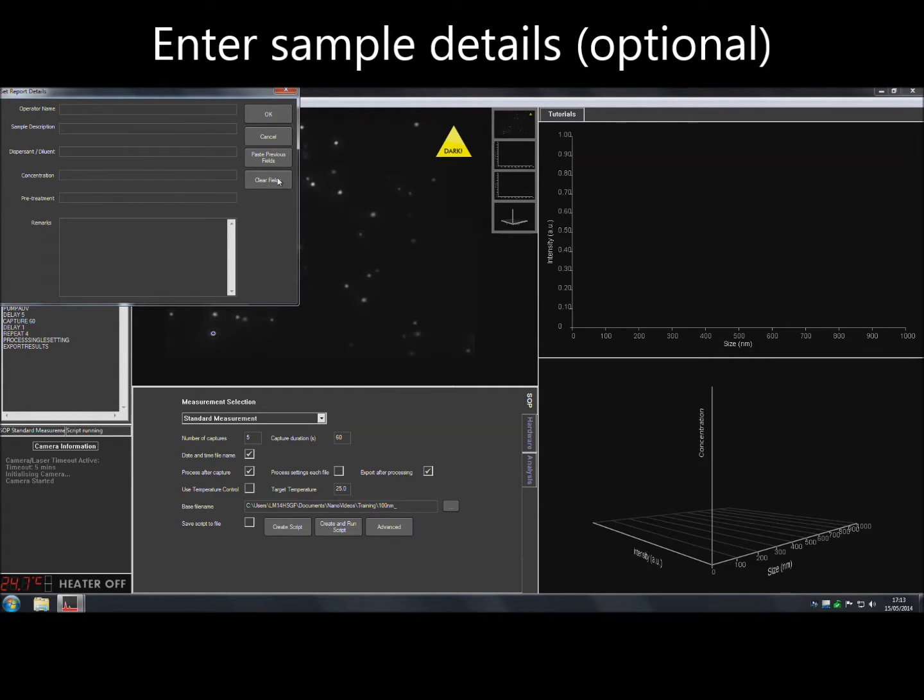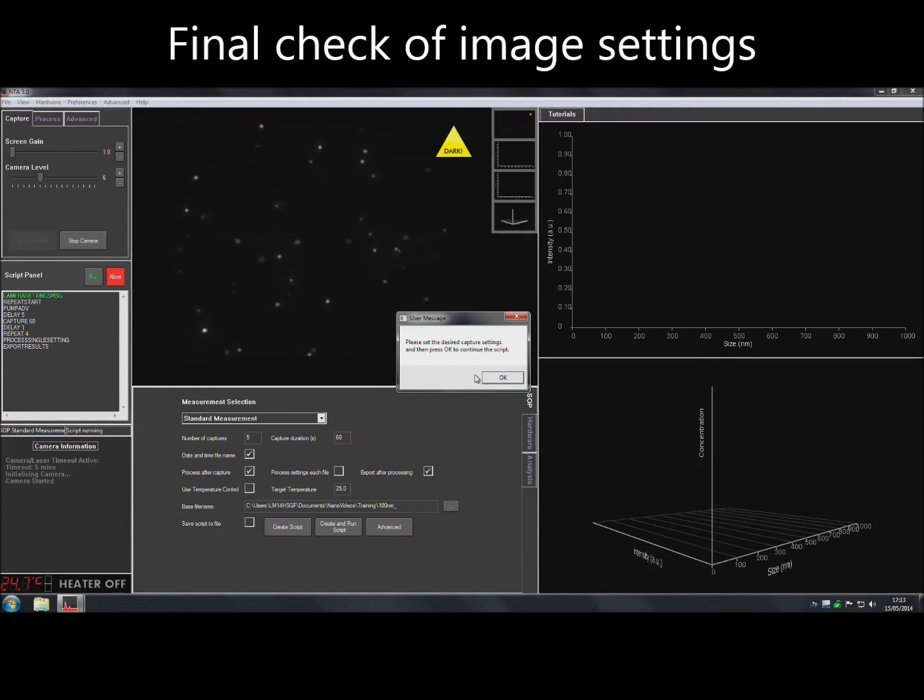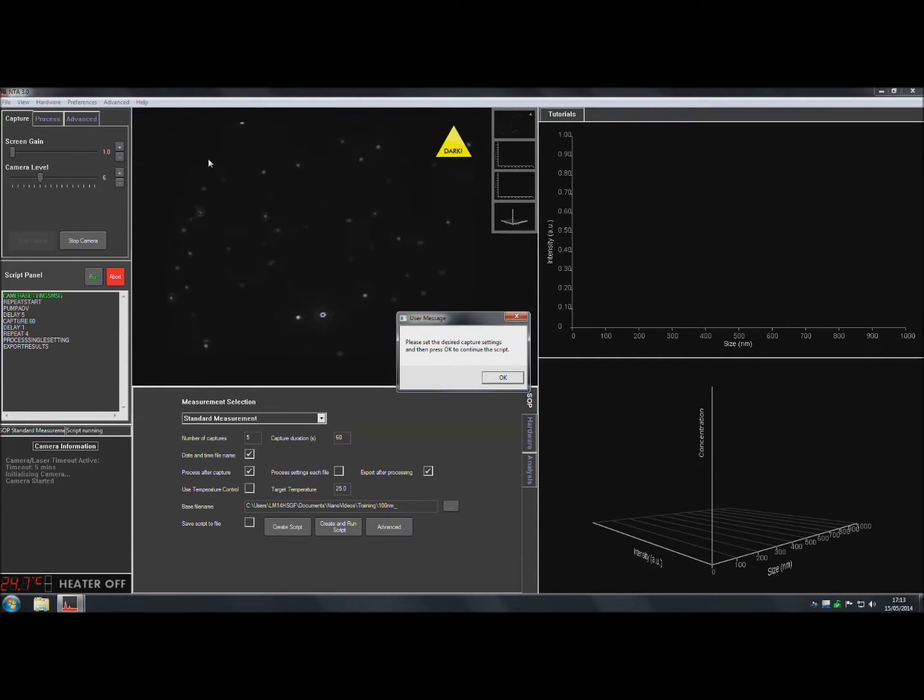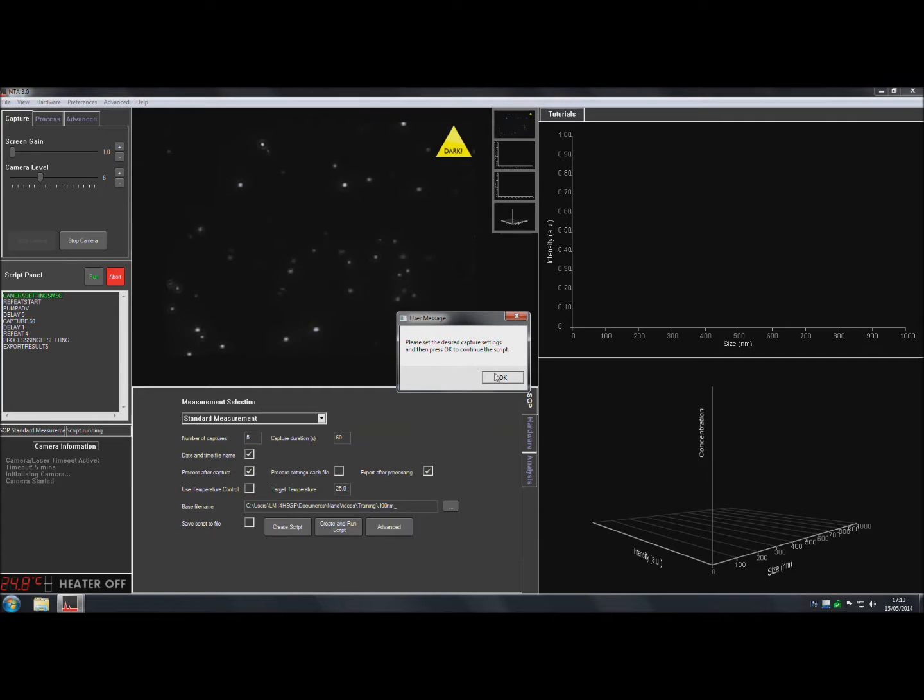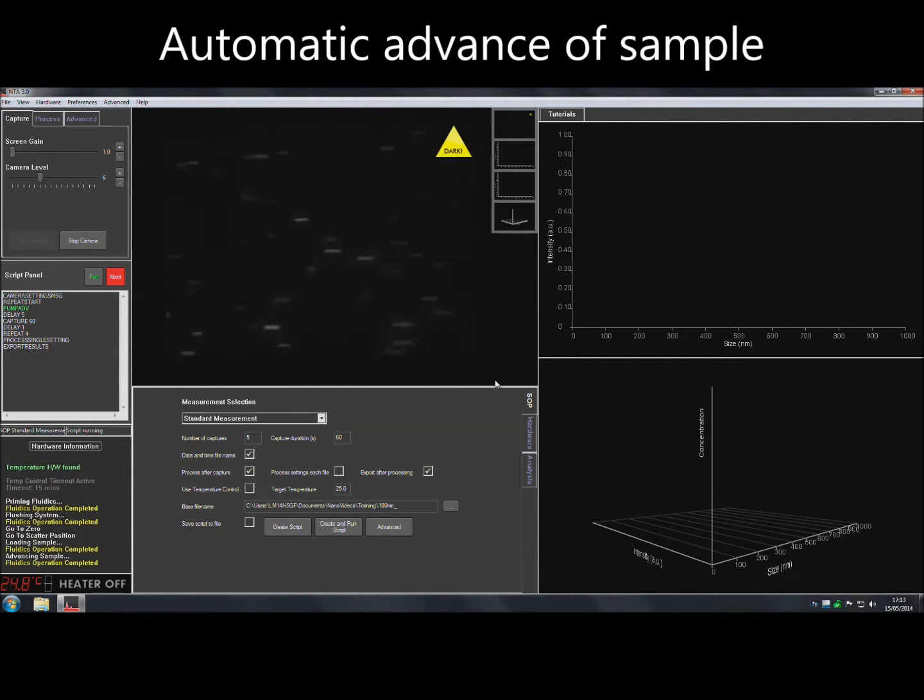Add some sample details if required and then click OK. The software will prompt for final image adjustments to be made. When finished, click OK and the software will begin recording the videos. The sample is automatically advanced during the script.